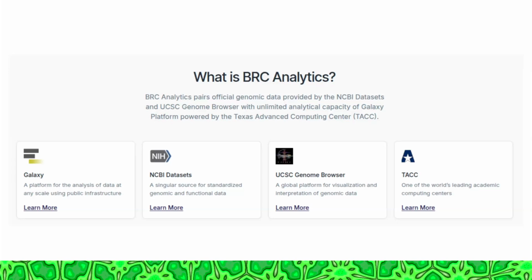The key difference between this resource and other resources is that we allow you to do analysis actually, meaning that we allow you to run complex computational pipelines. So today I'm going to show you, for example, reanalysis of 1,400 samples of Plasmodium vivax. In order to do that, you need a place to compute, because you need a place where you would upload your data, where you would run your tools, where you would interpret your results, and so on.